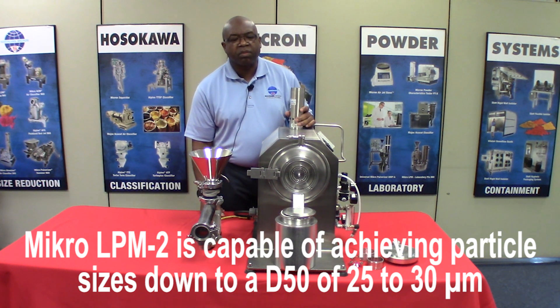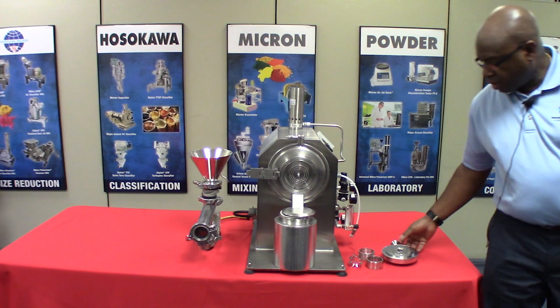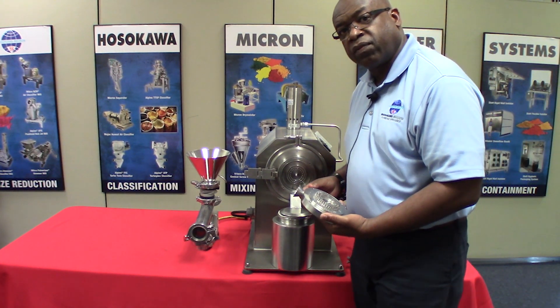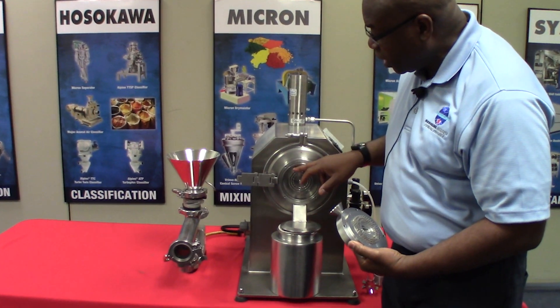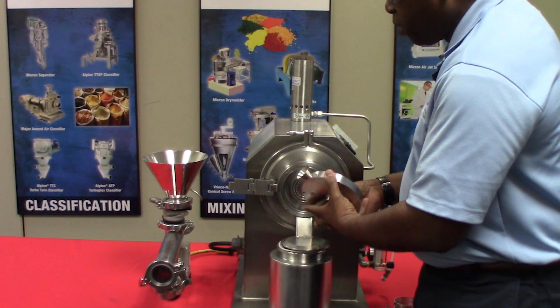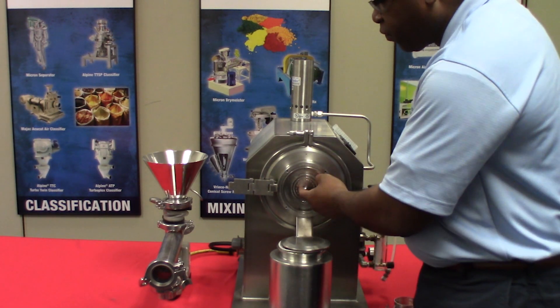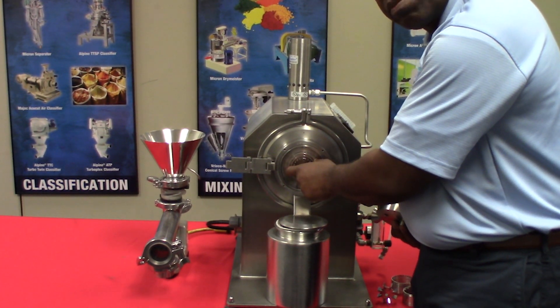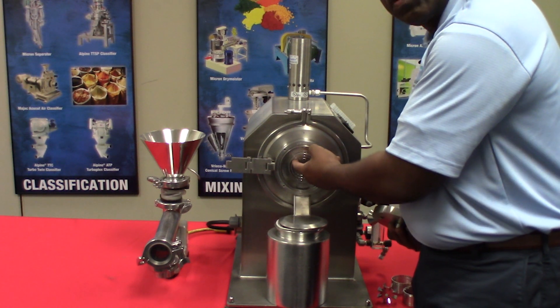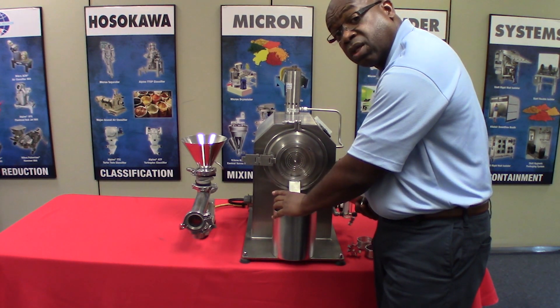The LPM2 mill is primarily a pin mill used mainly with crystalline materials. You have two sets of pin discs: a stationary disc on the door side and a rotating disc on the housing side. When the mill is closed, the two sets of discs intermesh with each other. Particles first enter via the center of the pin disc, and the top speed of this pin disc is 36,000 rpm. Particles must go through the rows of intermeshing pins, exit the grinding zone, and then the material is discharged into this container.